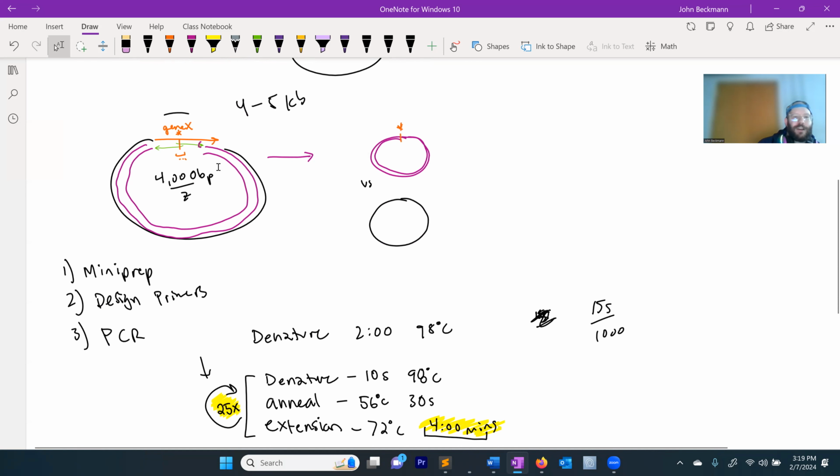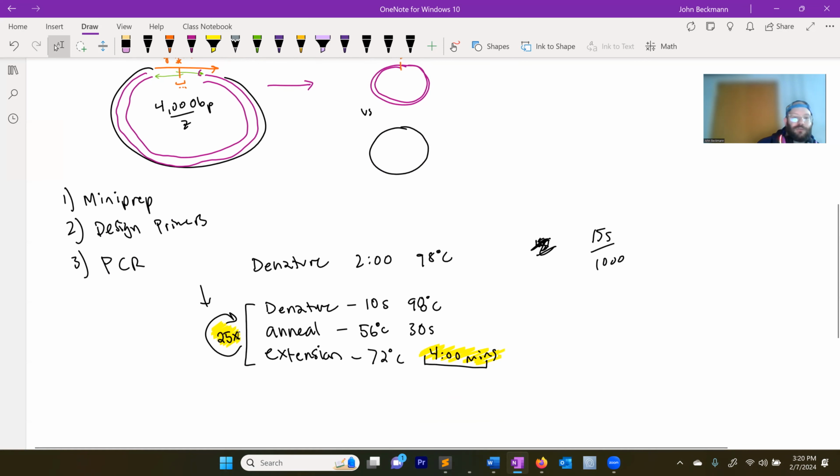Yeah, mutations. Even the best polymerase, if you go 10,000 base pairs, you're going to get a mutation. And so if you did two of these cycles, you're going to have at least one mutation, and if you do 4 cycles, you're going to have 2 mutations, etc. So when you increase the number of loops, you accumulate mutations, and it gets worse and worse.